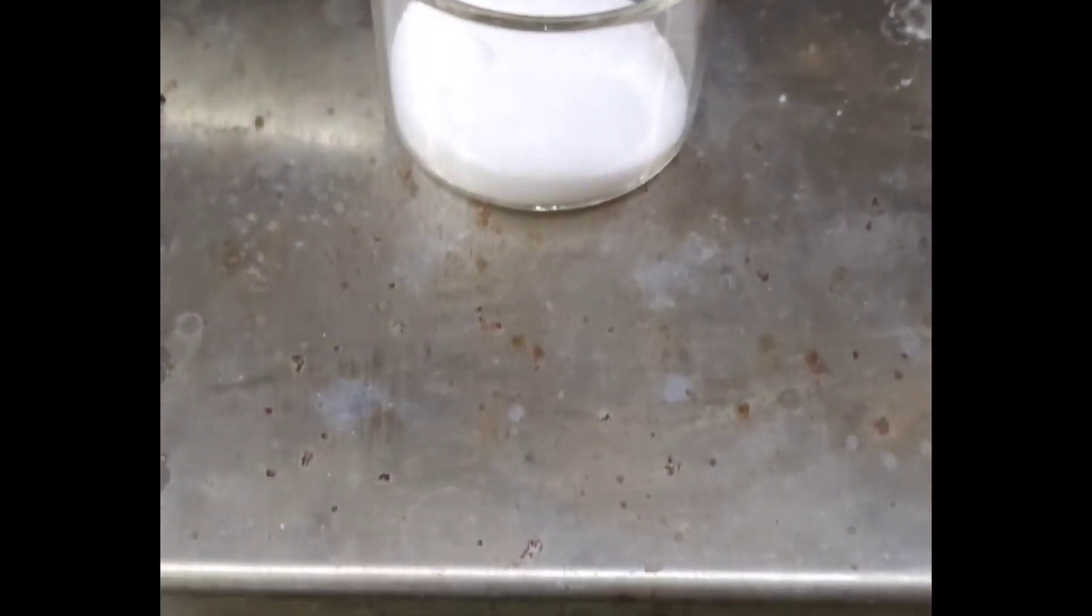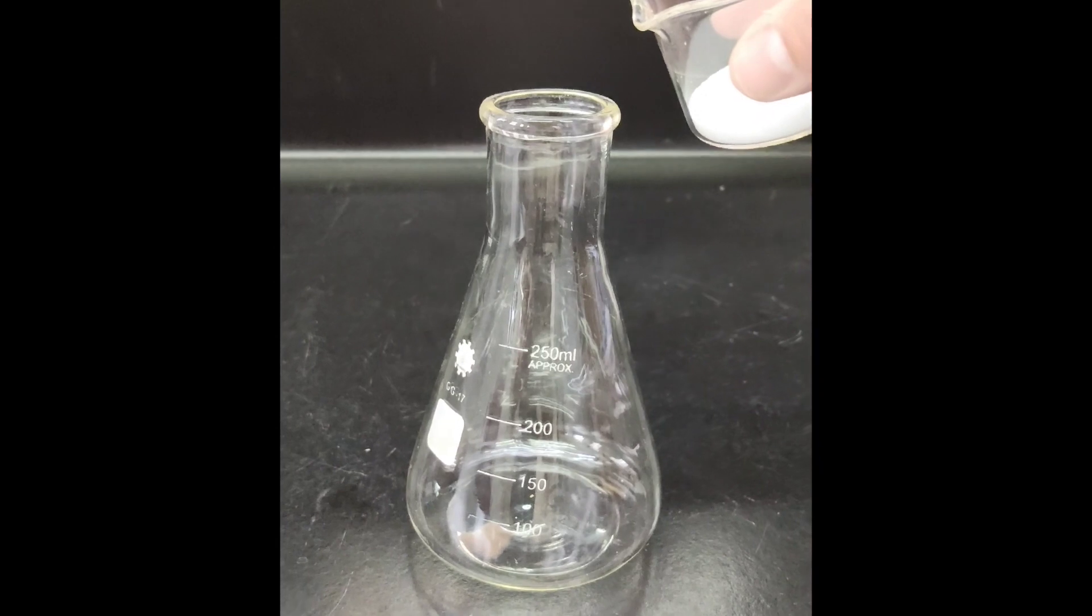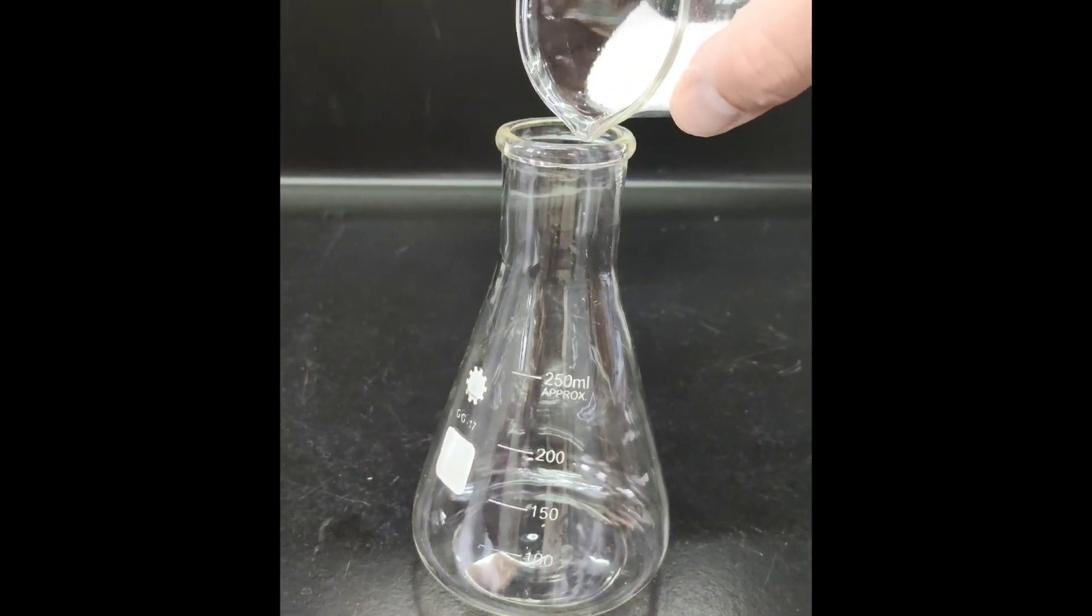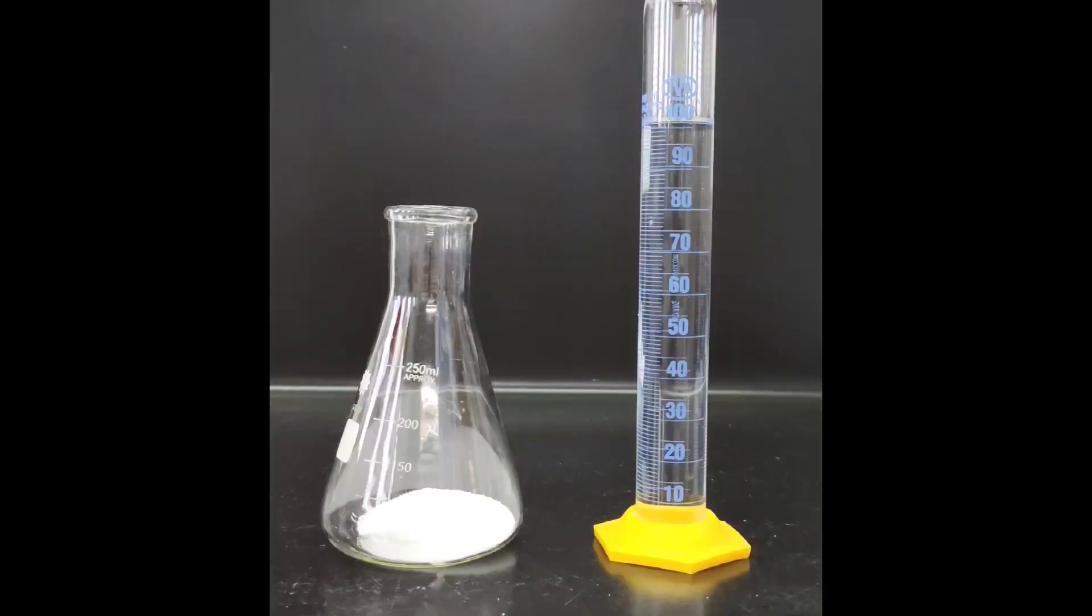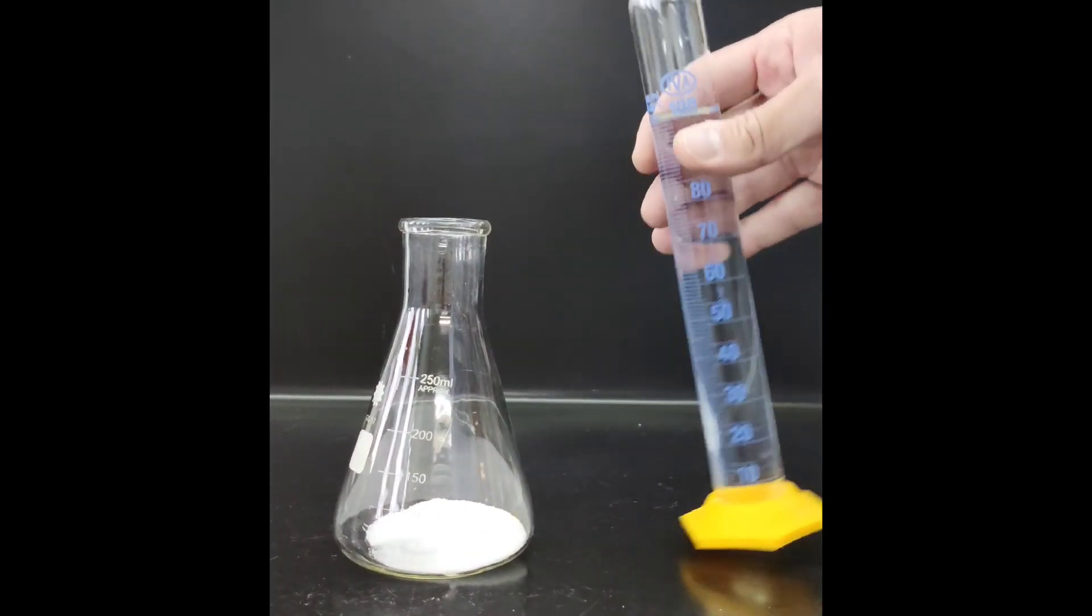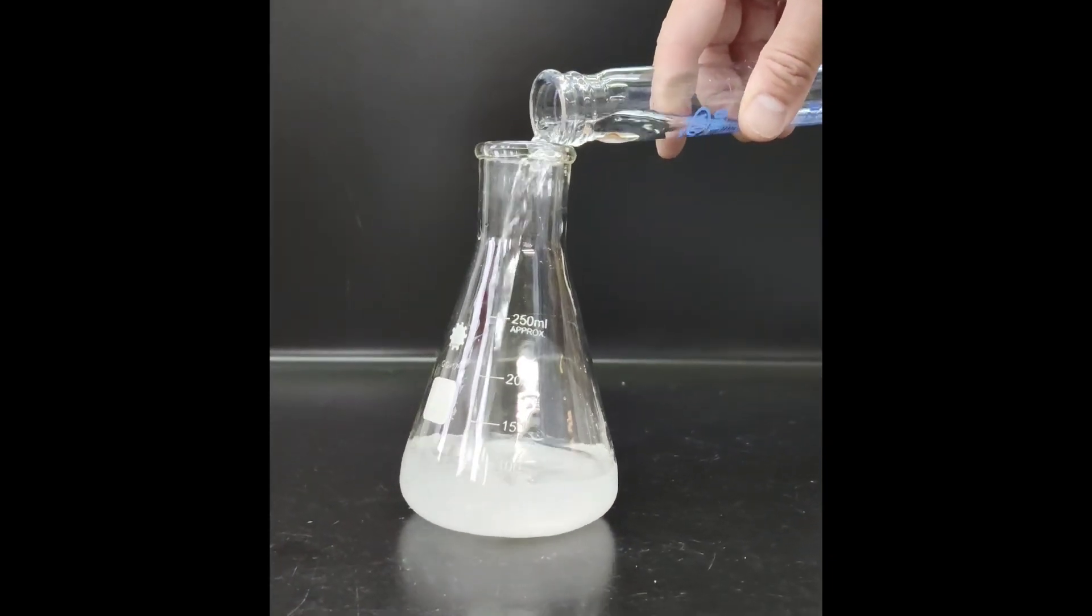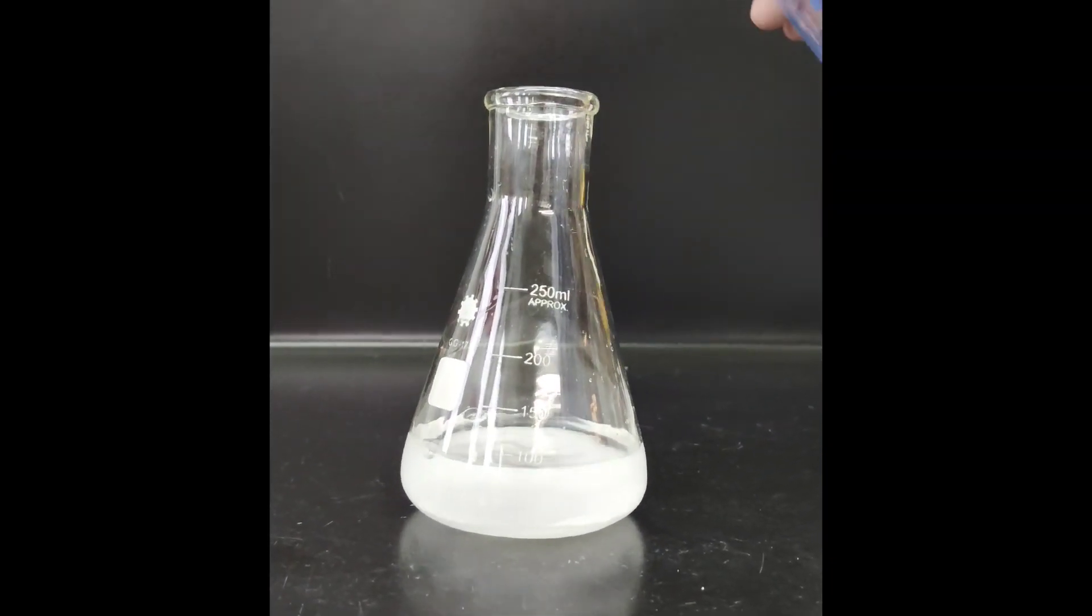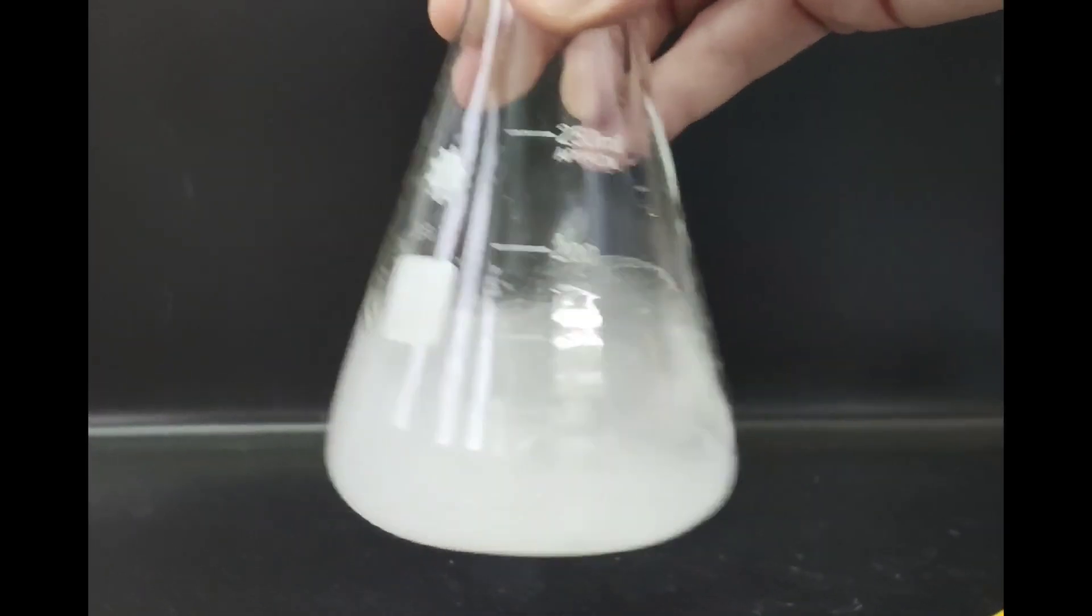While the reaction continues we weigh 20 grams of sodium chloride. We add the sodium chloride to a flask and then pour 100 ml of distilled water. We mix it thoroughly and then put it in the freezer for the remaining time of the reaction.